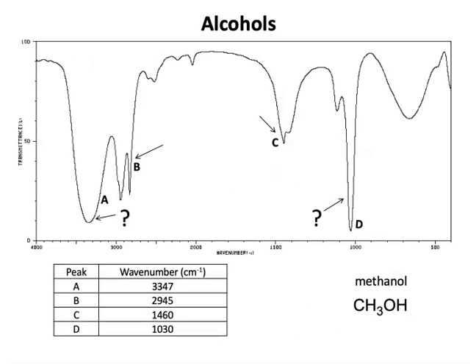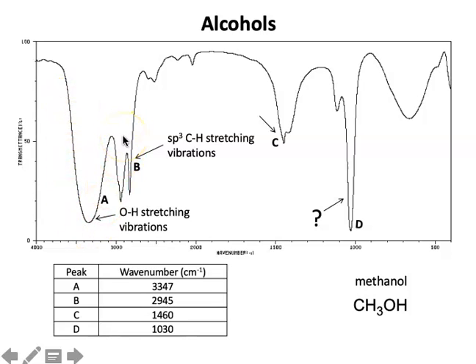Here's a general look at a pretty simple alcohol. The reason I show you this is that we've got this kind of less moundy than the carboxylic acid peak, but still a very intense mound out around 3,400 or so. That's indicative of an OH group. So I think about it in IR land this way: a carboxylic acid makes this thing a little messier looking, and an alcohol is a little bit more intense and a little bit nicer to look at. And of course, that guy is due to the OH stretch vibration.